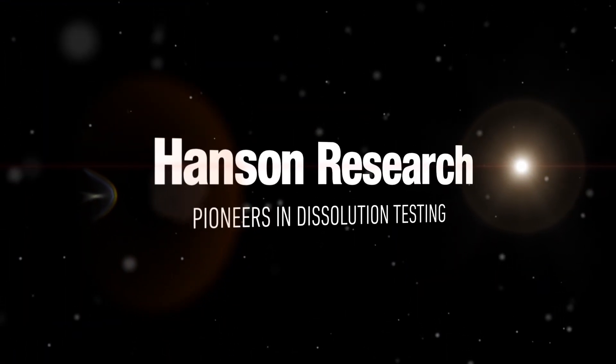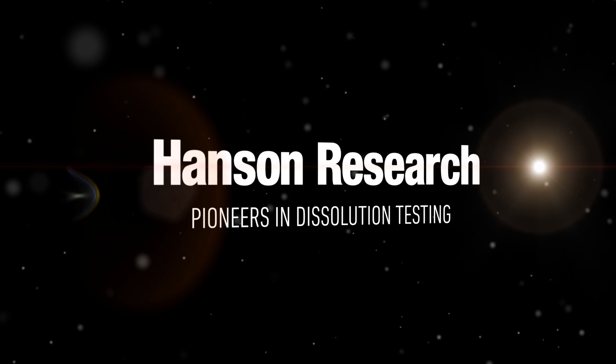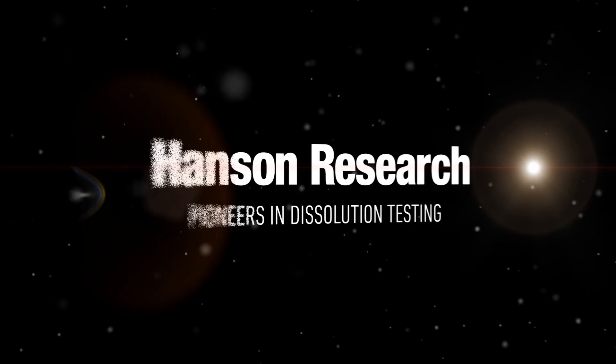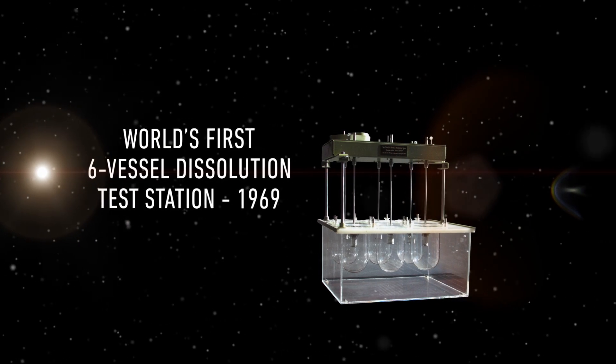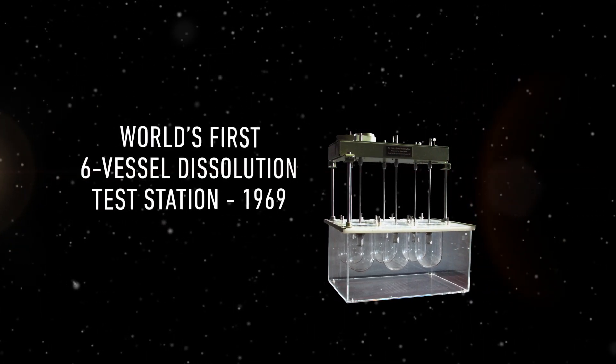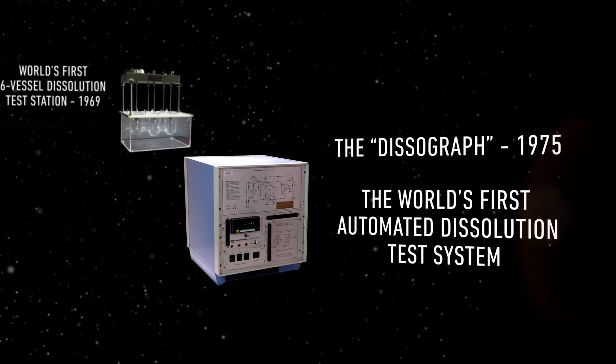The Vision G2 Elite 8 descends from a long line of dissolution test systems. In 1969, Hanson Research pioneered the world's first dissolution tester, followed in 1975 by the Dissograph, the world's first automated system.